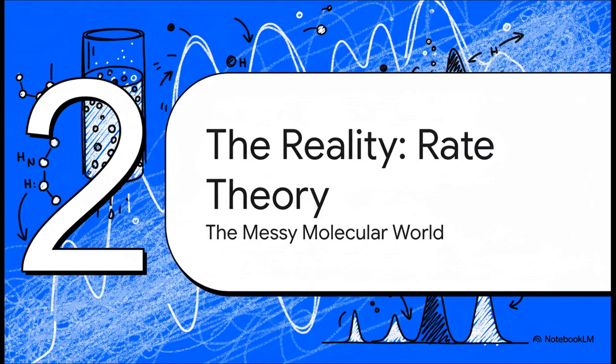And that is exactly where our second theory comes into play, rate theory. This is what takes us from that clean, idealized world of perfect plates and drops us right into the dynamic, sometimes chaotic, but much more realistic world of what's actually happening inside that column.